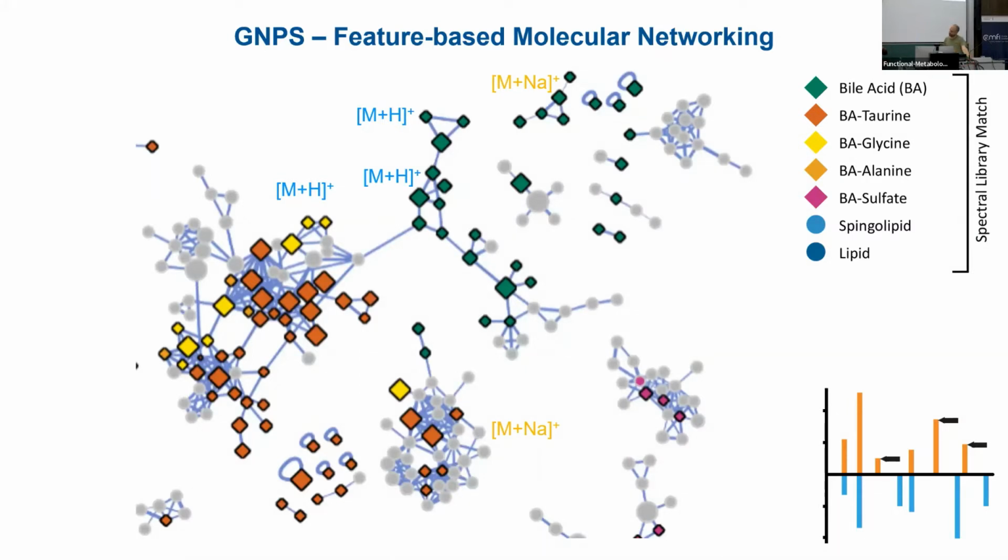So, those are more abundant than the M+H that everyone is looking for, right? So you could get to some wrong conclusions just looking at one ion. So it's always nice if you can find more. But perhaps the same applies as with the feature finding yesterday. These are pretty fancy tools, but they're not showing you absolute truths, right? That's just one way of looking at the data, and it's full of caveats and perhaps artifacts. So you, as the experts, are needed to be critical about what you find.